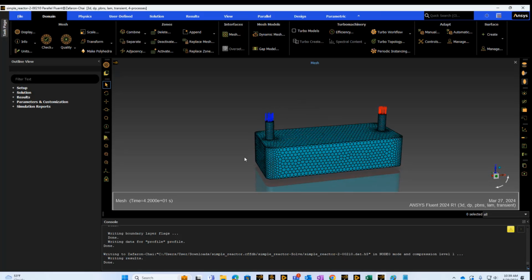And the entire chamber is filled with, basically in this case, the PCR mix. And we're modeling that as a simple fluid, and we're using the water properties in this case.